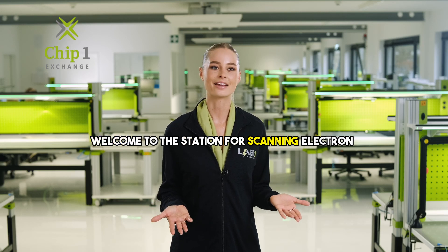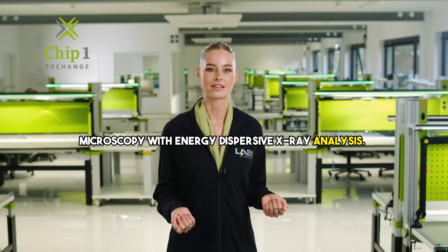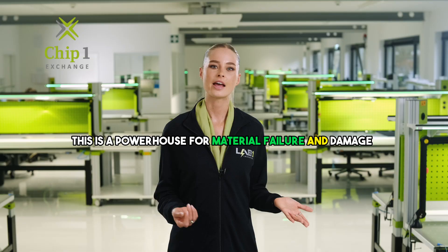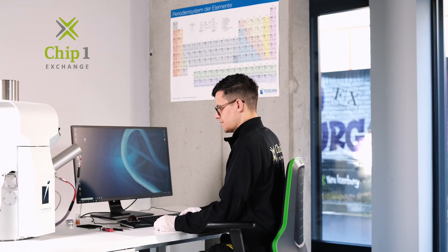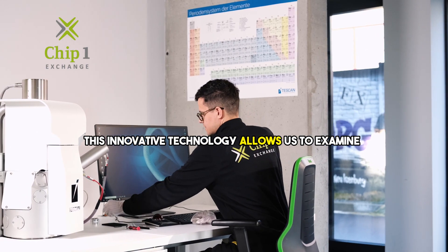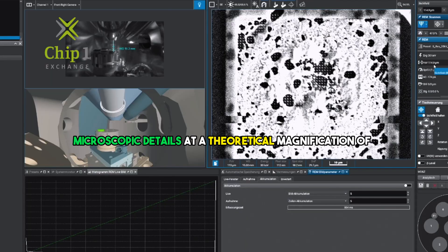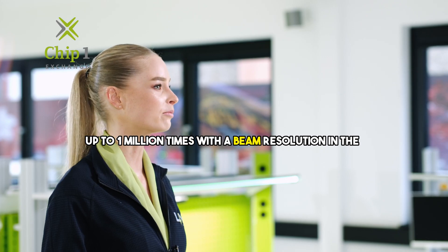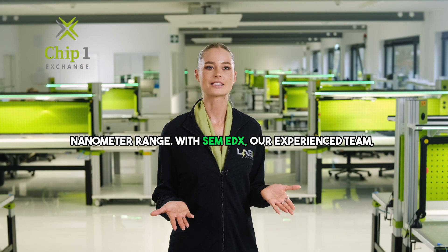Welcome to the station for scanning electron microscopy with energy dispersive X-ray analysis. This is a powerhouse for material failure and damage analysis on material surfaces and cross sections. This innovative technology allows us to examine microscopic details at a theoretical magnification of up to one million times, with a beam resolution in the nanometer range.